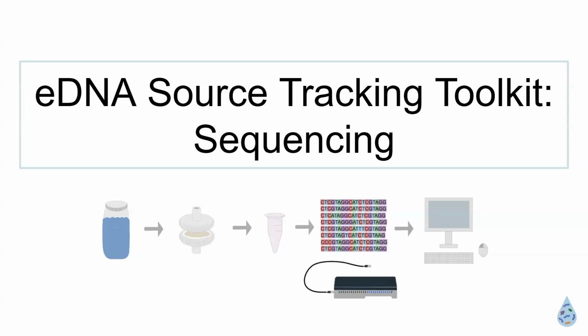So we check the USGS gauge stations for freshwater discharge, rainfall, and then we also brought along a YSI, which is an environmental instrument that can collect dissolved oxygen, temperature, salinity of the water, so that we have all that information to help us figure out the context clues to the sample that we get. But yeah, rain did not stop us.